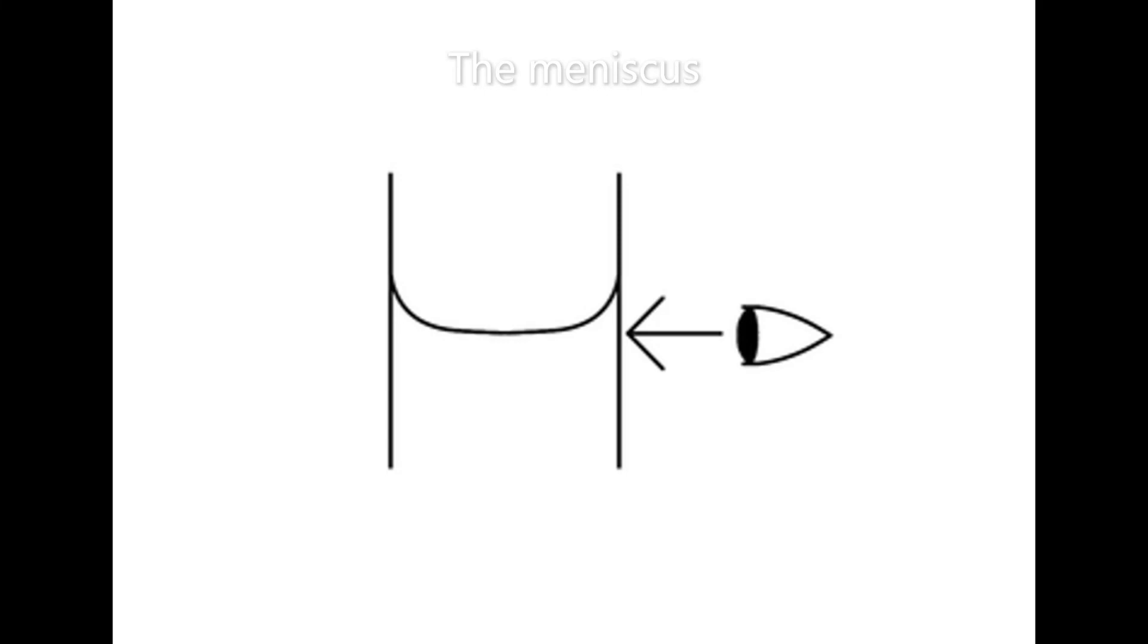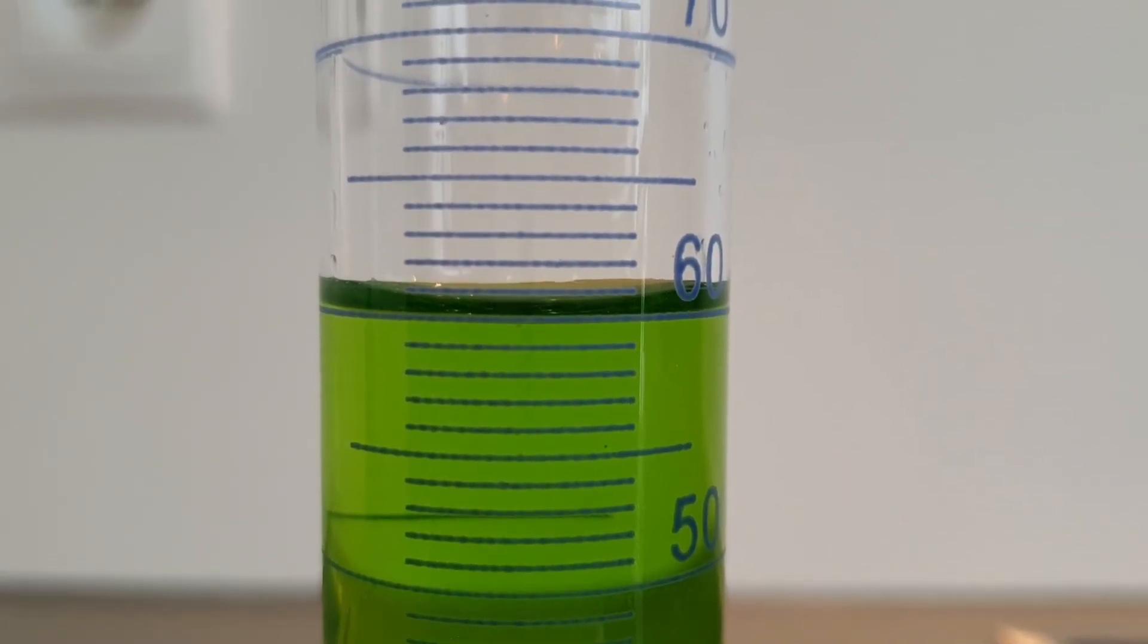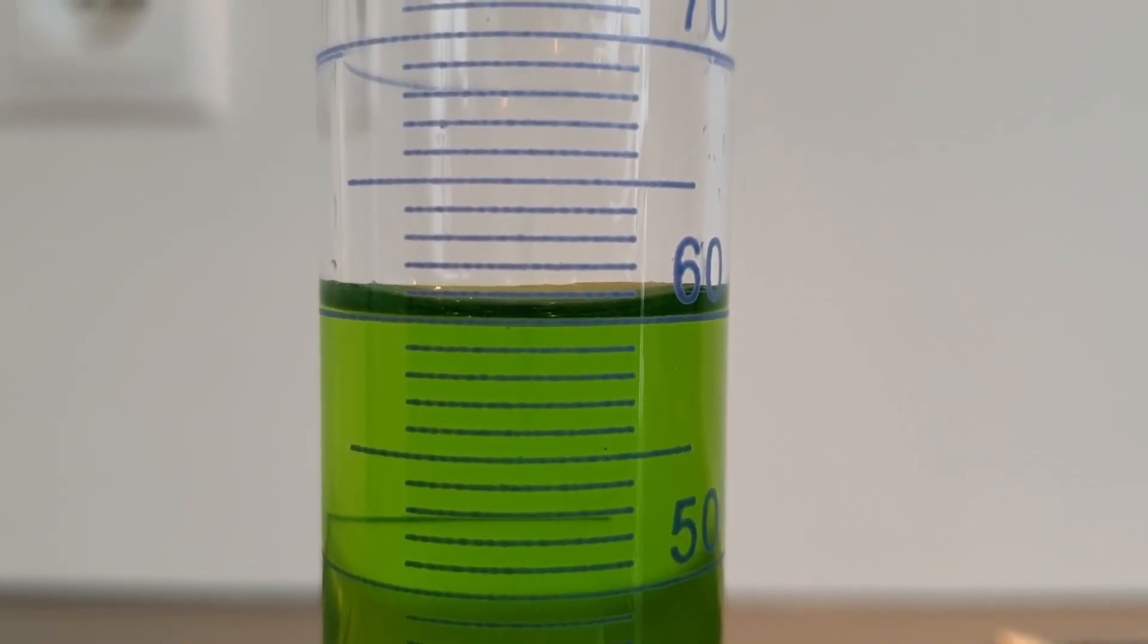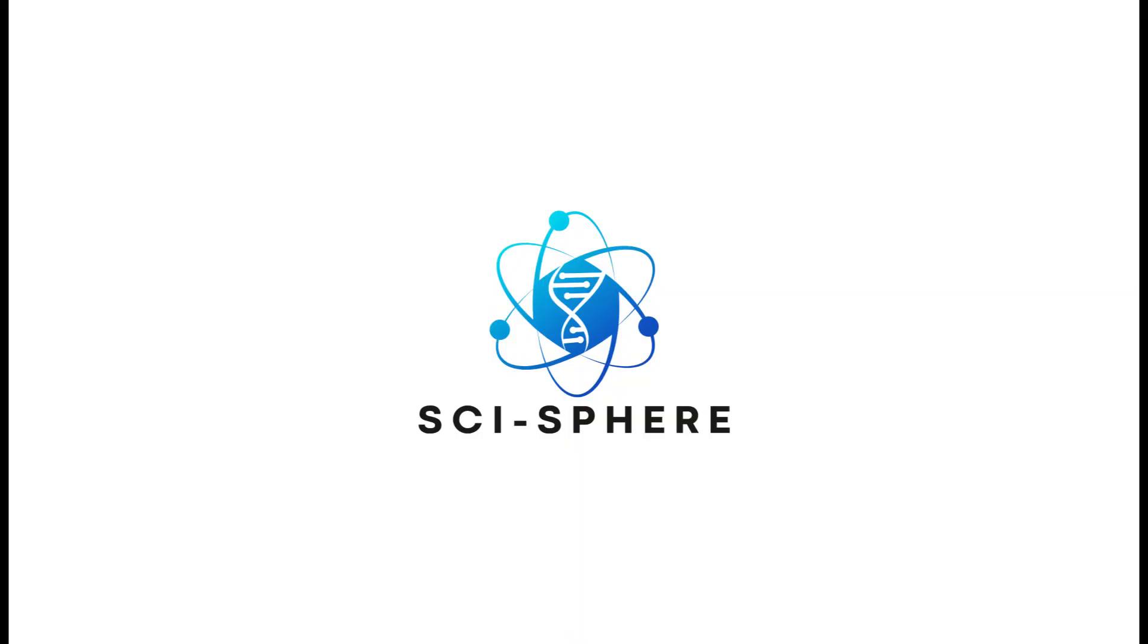This curve is what we call the meniscus, and there you have it, right on the meniscus line for 60 milliliters.